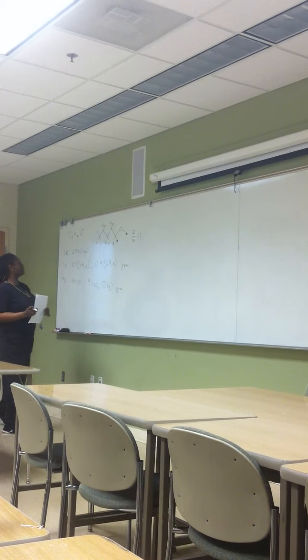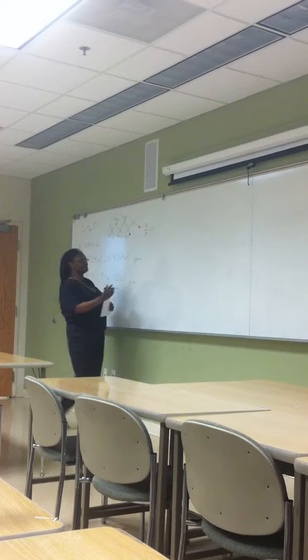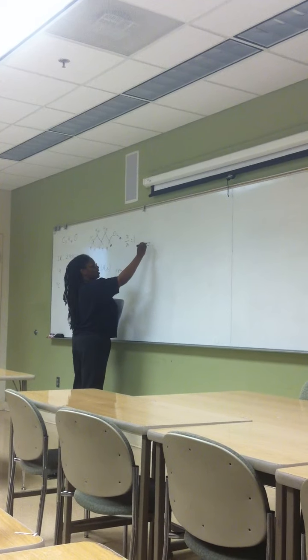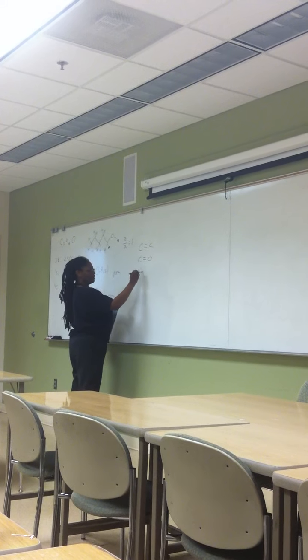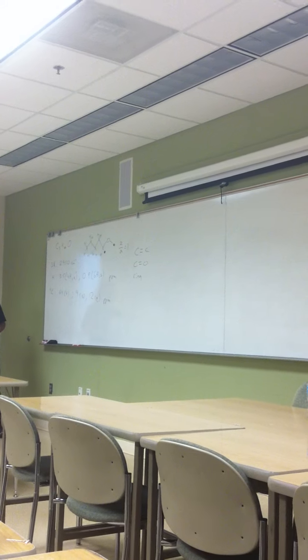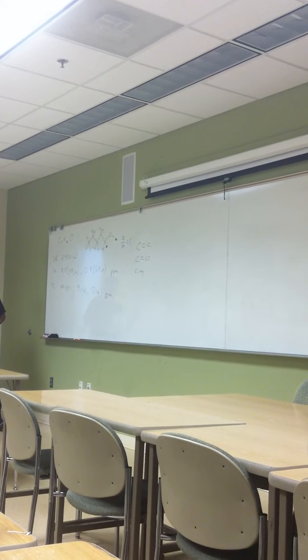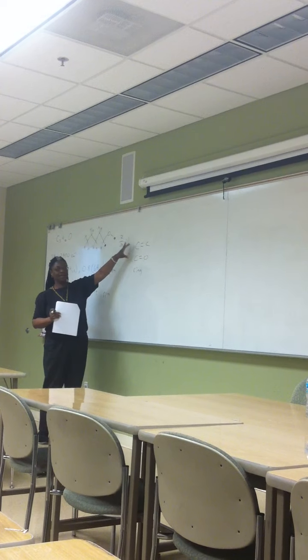And so that pretty much means in this compound that has carbon, hydrogen, oxygen, I'm either going to have a carbon-carbon double bond, a carbon-oxygen double bond, or a ring. I can't have a carbon-carbon triple bond because that would be 2 elements of unsaturation. Okay? And so now you can look at IR.